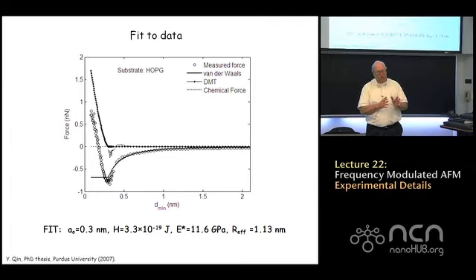Laser photodiodes, these position-sensitive detectors, the lasers themselves that you use for a beam bounce technology, those tend not to be compatible with ultra-high vacuum. If you put those inside a vacuum chamber, you'll never get 10 to the minus 9 torr. They outgas. They're made out of plastic. So you have to use different technologies to do UHV.